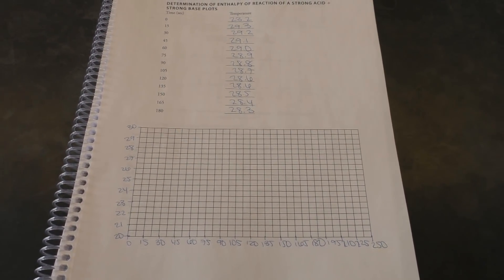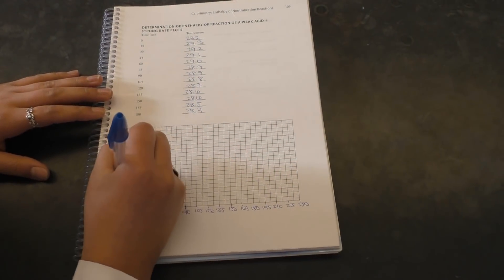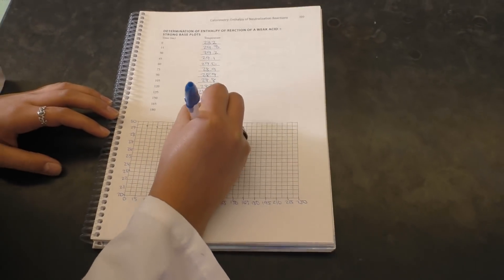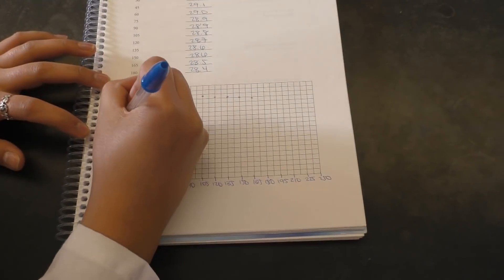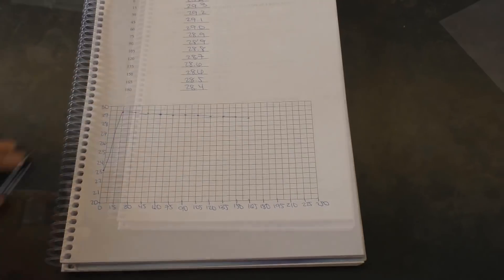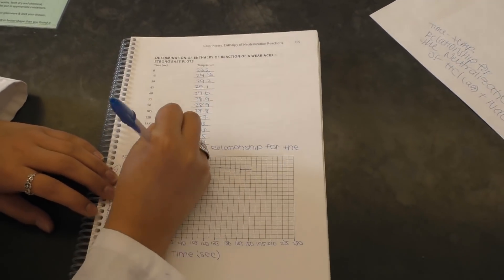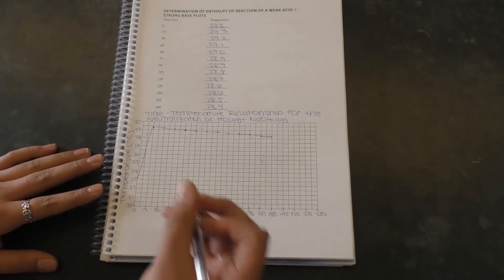So then using the provided graph paper, we have labeled our axis to maximize the space available. Next, we need to plot the data points. You also need to add a line that connects your data points. This will help you see the relevant temperatures you need for your calculations. Next, you definitely need to add a graph title. Y versus X is most appropriate, and then you need to label your axis.